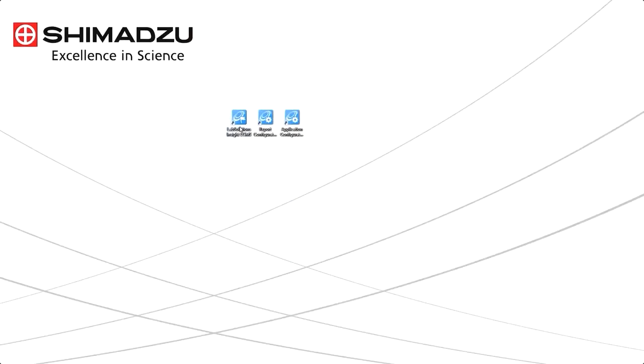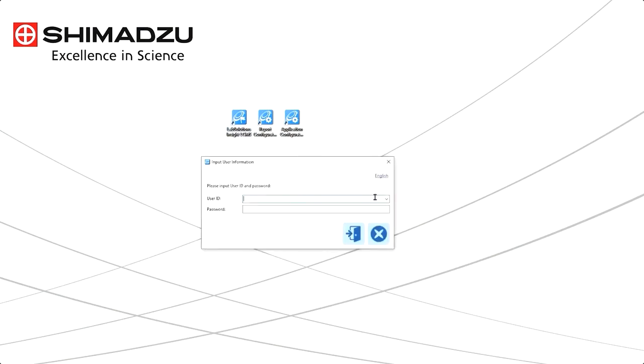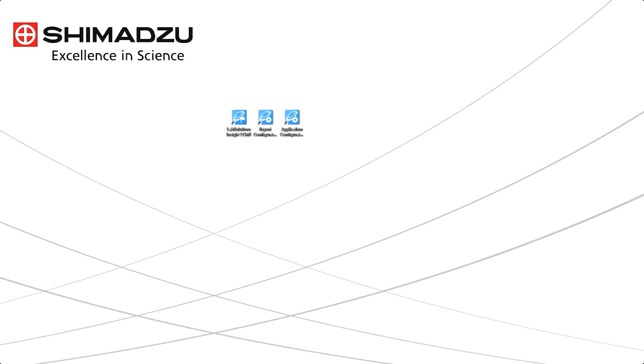Hello, my name is Megan Davis and I am a LCMS product specialist here at Shimadzu. This is a quick video on how to review and process quantitative data in Insight. LabSolutions Insight is a software designed to swiftly process and review large quantitative data sets. Select LabSolutions Insight LCMS and enter the appropriate user information. The default is admin as the user ID and no password.